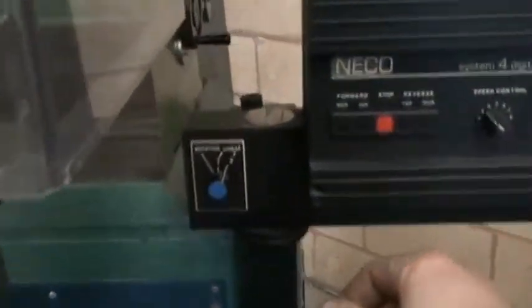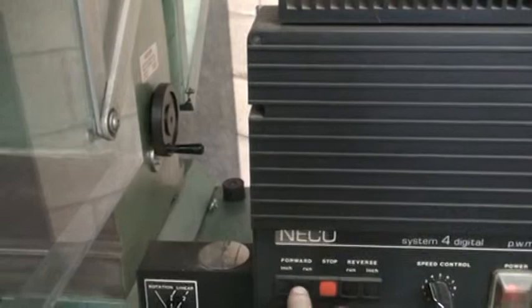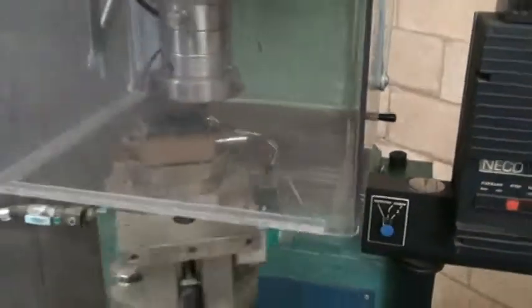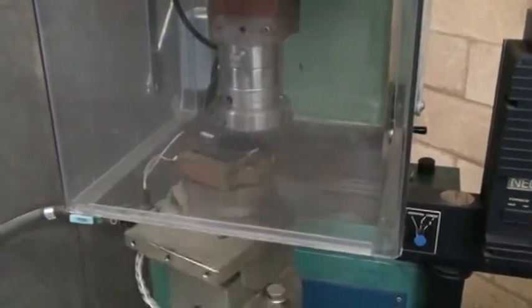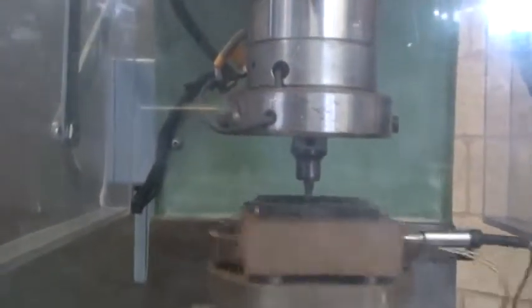The first mode we'll check is the rotational, so you flip this switch. There's a digital motor controller here — we just hit run, and then you can increase or decrease the speed. Then we flip the ram switch and the ram will come down into the rubber while it's spinning. You can set it for one shot or it will come down and stay on the rubber.